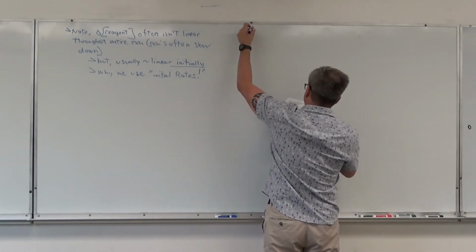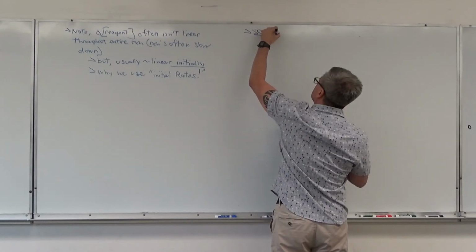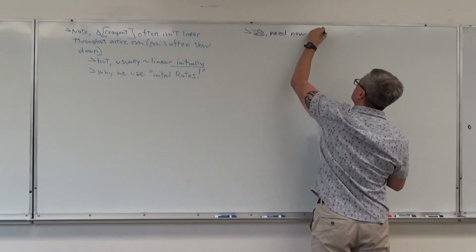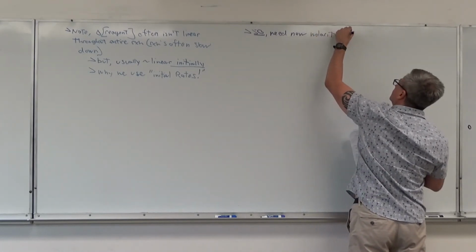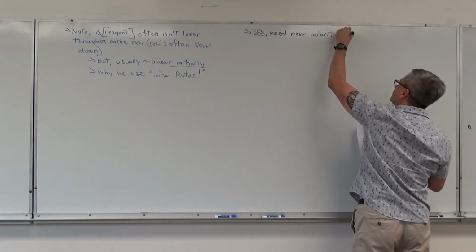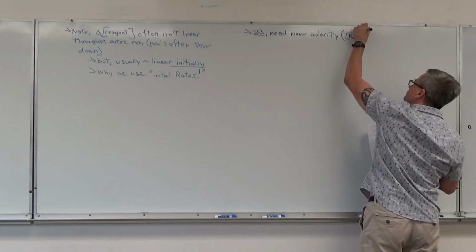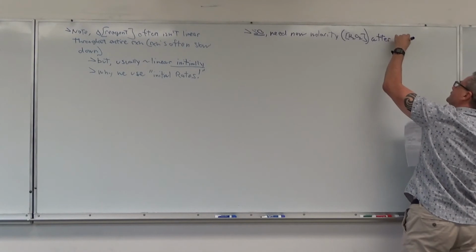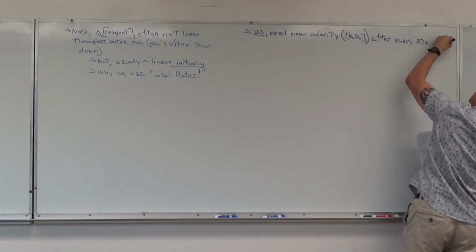Okay, so let's look at the big picture here. We need the new molarity (put in parentheses) of hydrogen peroxide after every 30-second interval.